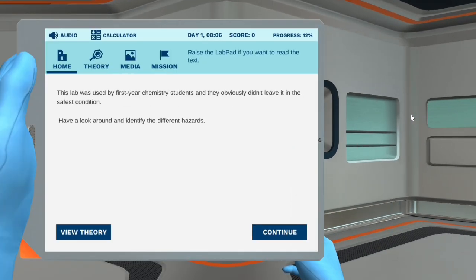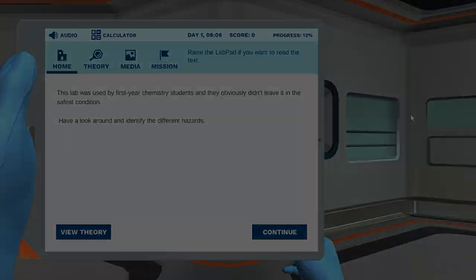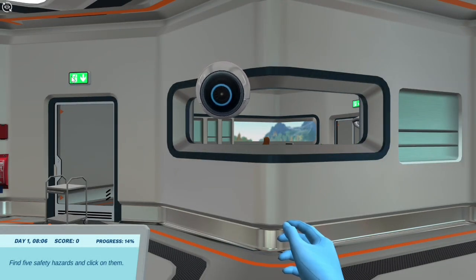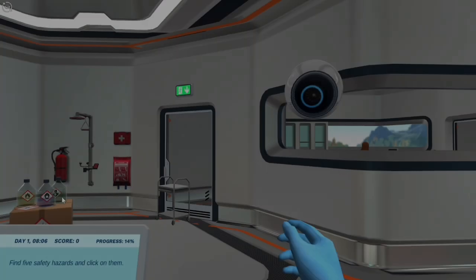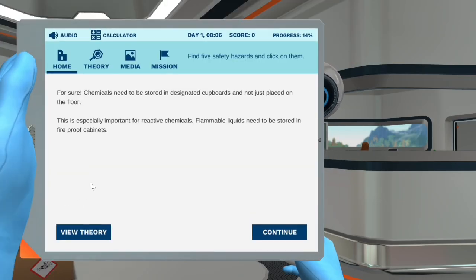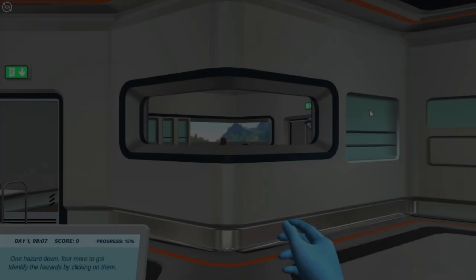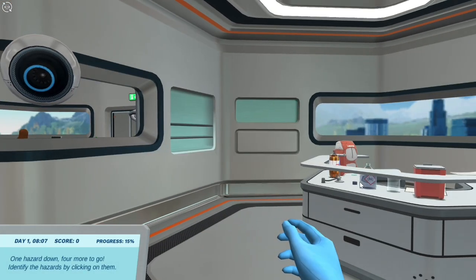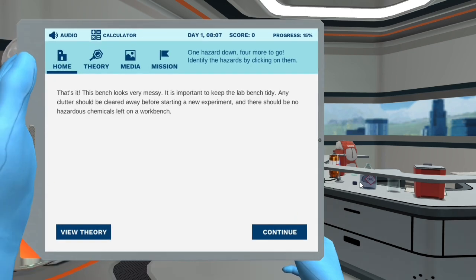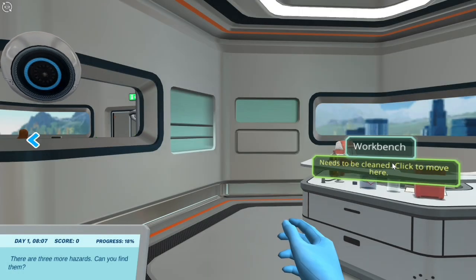This lab was used by first year chemistry students and they obviously didn't leave it in the safest condition. Have a look around and identify the different hazards. Find five safety hazards and click on them. Chemicals need to be stored in designated cupboards and not just placed on the floor — this is especially important for reactive chemicals. Flammable liquids need to be stored properly. One hazard down, four more to go. This bench looks very messy. It is important to keep the lab bench tidy — any clutter should be cleared away before starting a new experiment, and there should be no hazardous chemicals left on the workbench. There are three more hazards. Can you find them?